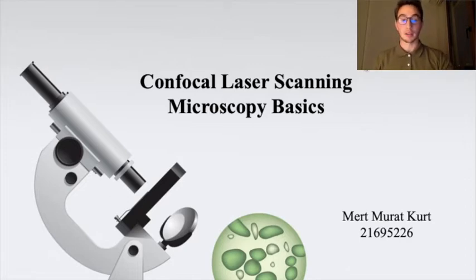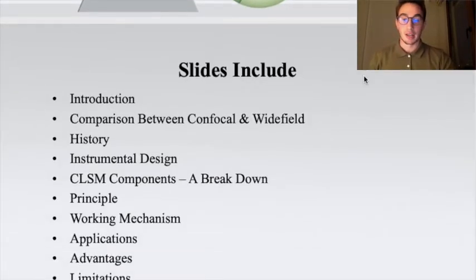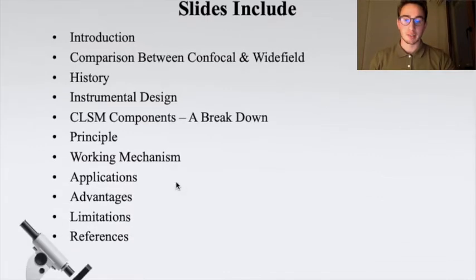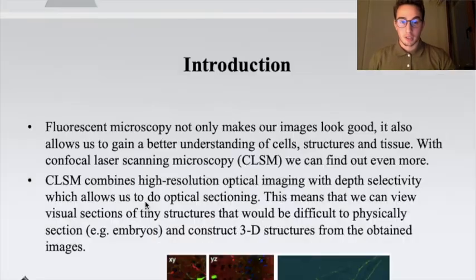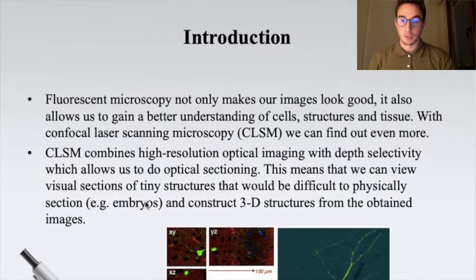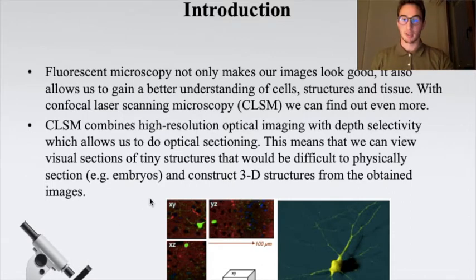So let's get started with the slides. I have three main parts: the introduction, the working principle, and the advantages and limitations of this confocal laser scanning microscopy system. I would like to move on to the introduction part, and this is the important part, I think.